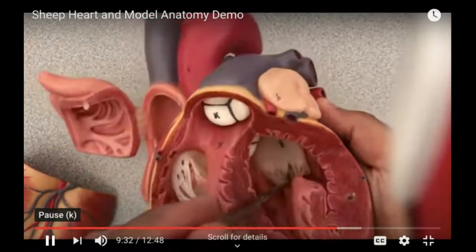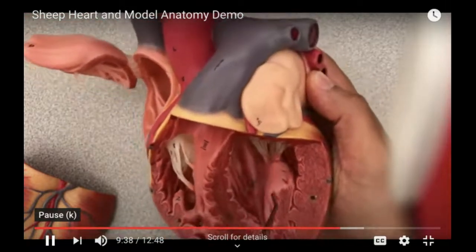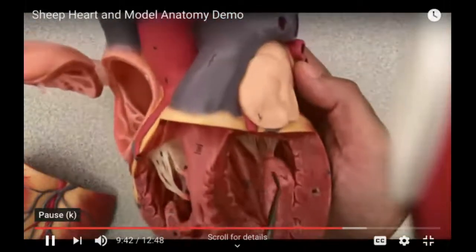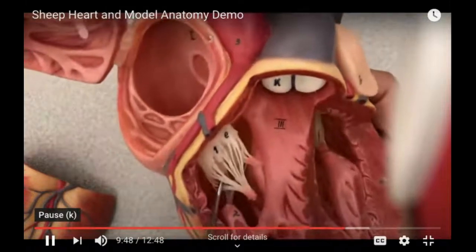And then this large chamber here would be the left ventricle. Here's a papillary muscle. Here are your chordae tendineae.